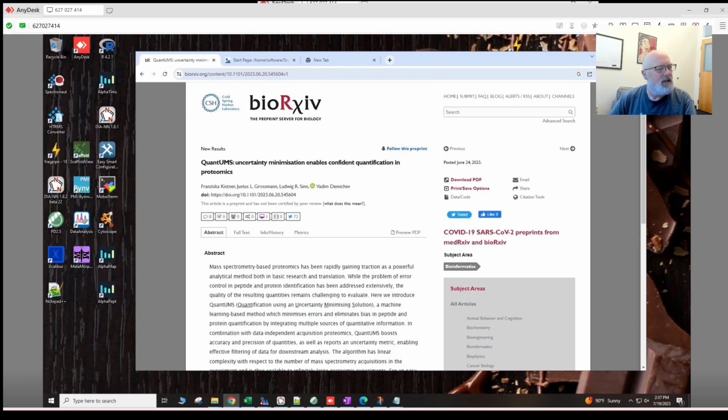All right, everybody. I thought I would give you a quick video on how to turn DIANN results into Skyline so you can visualize the peaks. It took me too long to figure this out. There's only one part that's not documented, and I had to ask the Skyline support team, which is super useful. But once I worked that out, really easy.